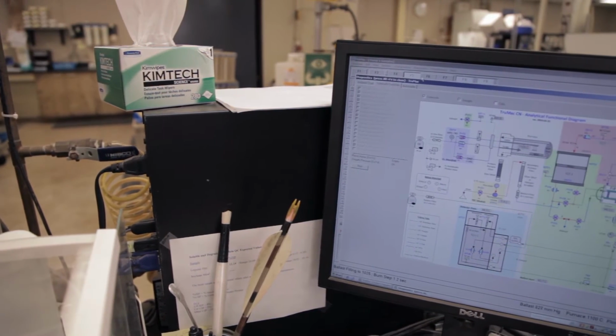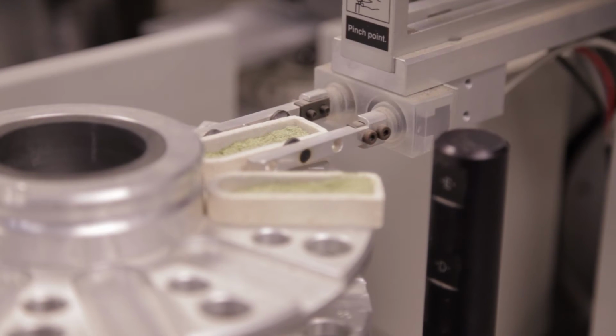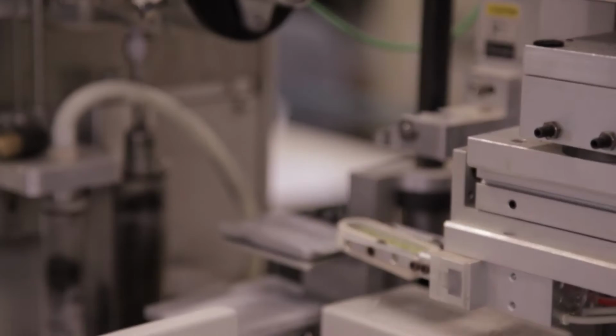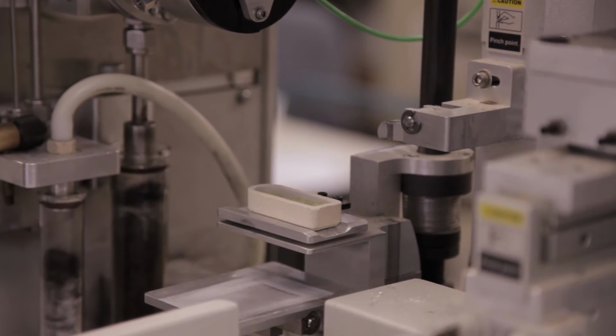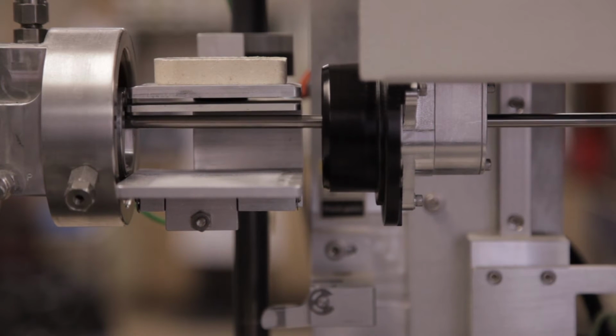Nitrogen analysis is determined by the combustion method. The portion of the sample is weighed, introduced to the instrument. The sample is then combusted or burned, and the nitrogen gas collected, and the nitrogen content determined from there.